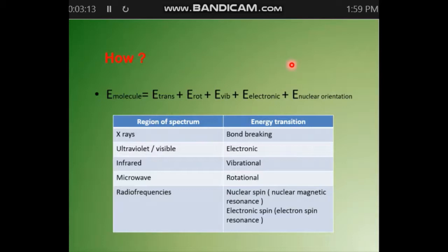So how does IR spectroscopy work? We know the energy of any molecule is the sum of energies from translational, rotational, vibrational, electronic and nuclear orientation of the molecule.